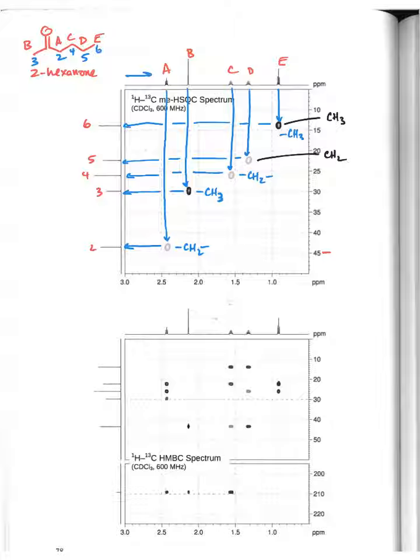So notice that the HSQC data is direct H to C correlation. Notice that the sp2 hybridized carbon, which does not have hydrogens, does not show up on this projection. And so it's, again, a direct H to C correlation. So if the carbon does not have hydrogens, you're not going to see a peak in this piece of data.